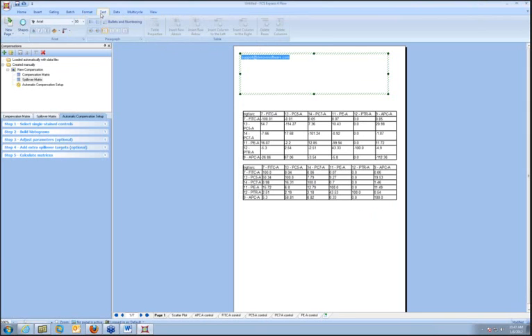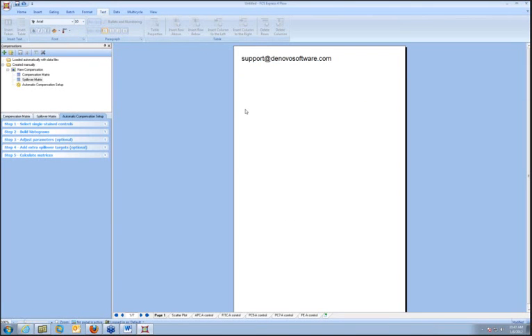This does work on both FCS2 and FCS3 files, although of course FCS2 files are usually too low resolution to do really proper software compensation, but it will work. Everything I showed here works on both of them, given that caveat.